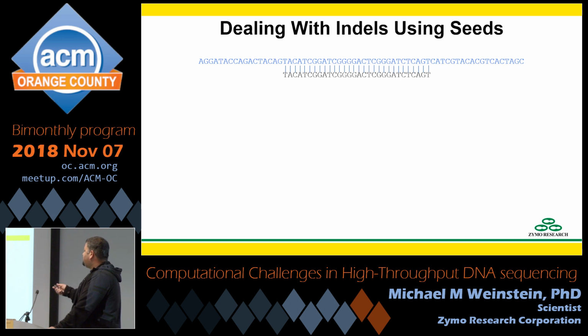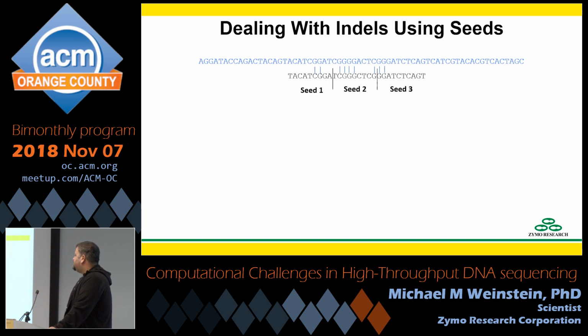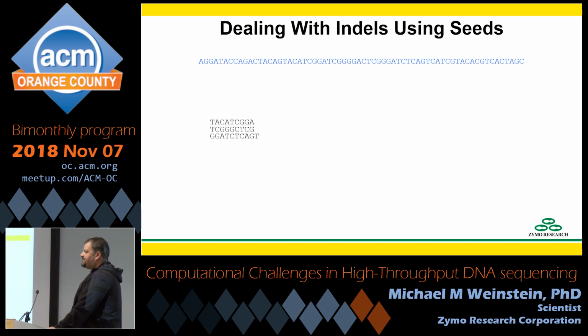So I'm going to take this perfect match I had before, and I'm going to arbitrarily drop 2 bases from the middle. So I just created a deletion. And if you look at it now, it doesn't match up very well there at all, even though I just showed you that's where it came from. So I'm going to break this up into 3 seeds, and these seeds are basically, I think about 9 bases each, a little bit longer maybe. And I'm going to take these seeds and I'm going to align them individually.